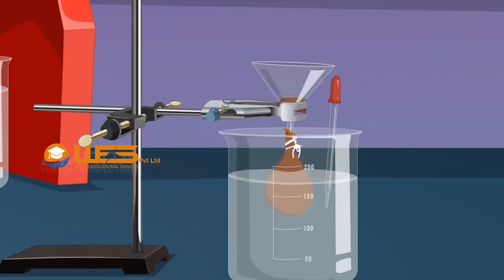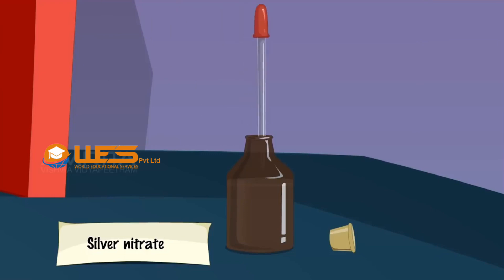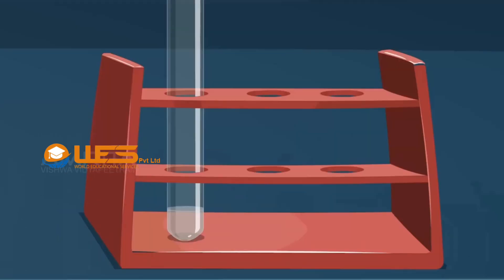Take a small amount of water from the beaker using a dropper and transfer it into a test tube. Add a few drops of silver nitrate solution. If a white precipitate is formed, dialysis should be continued. If no white precipitate is formed, chloride ions are absent, indicating that dialysis is complete. Otherwise, the sol still contains chloride ions and dialysis should be continued.